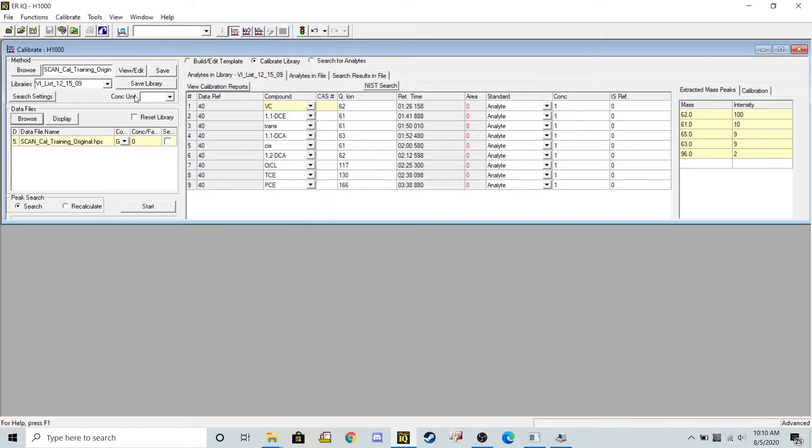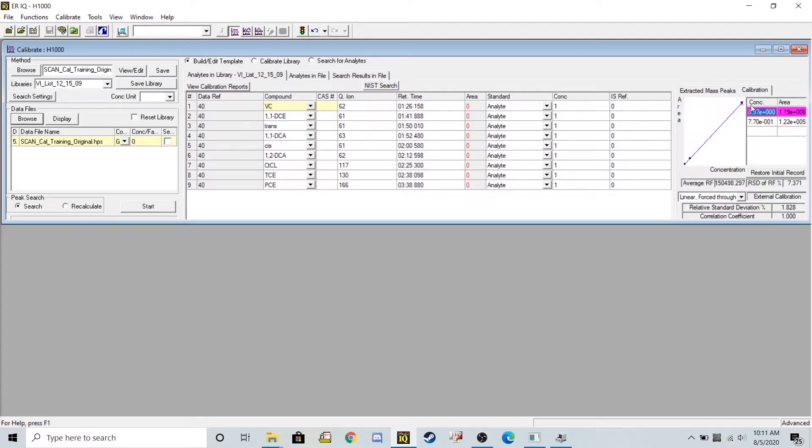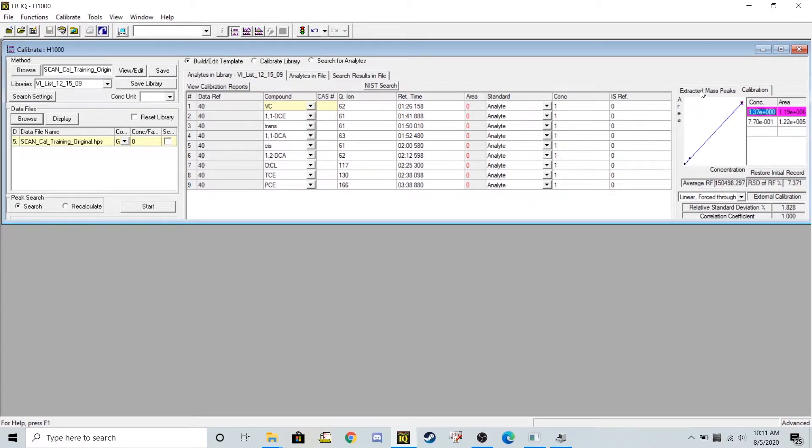I'm going to go ahead and put in a few different things. So I'm going to start with build edit template because I'm going to redo the calibration curve that already exists here to make my own brand new calibration curve for specific chemicals.